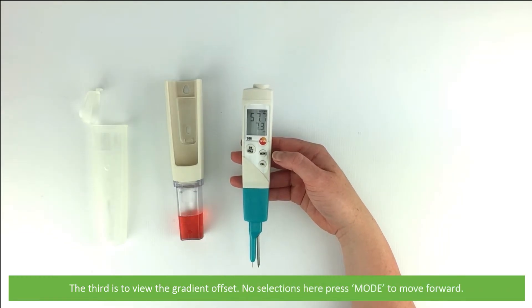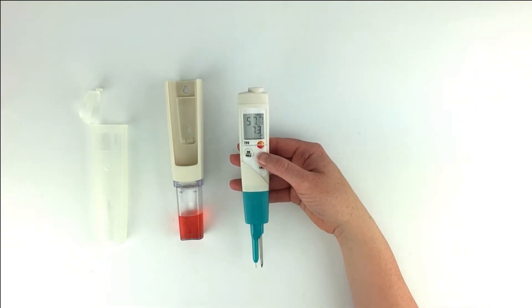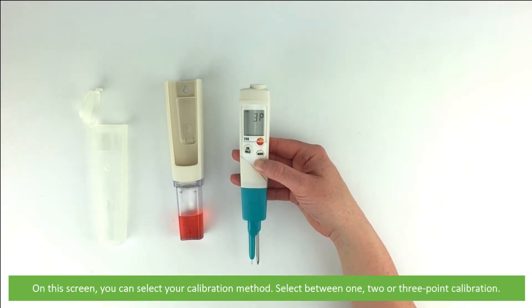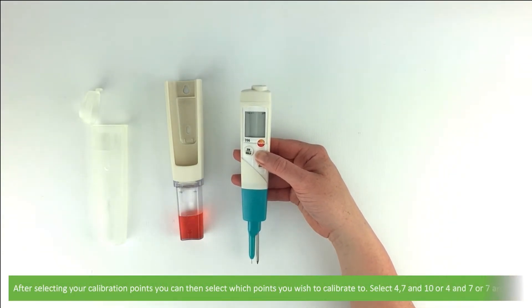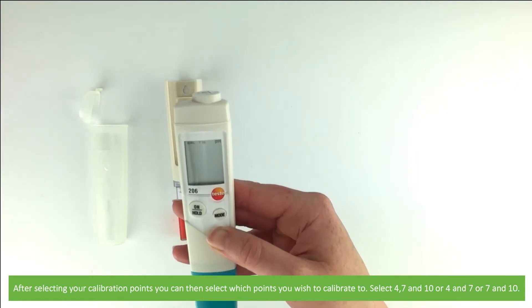The third is to view the gradient offset. There are no selections here, so press mode to move forward. On the screen you can select your calibration method — select between one, two or three point calibration. After selecting your calibration points, you can select which points you wish to calibrate to: select between four, seven and ten; four or seven; or seven and ten.